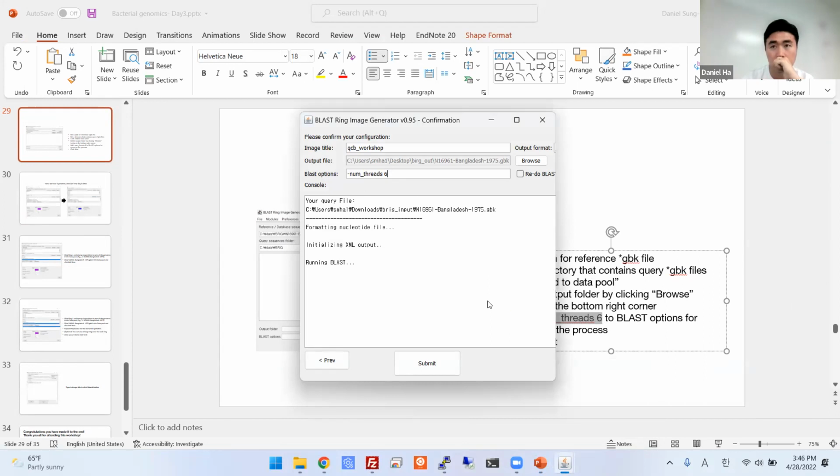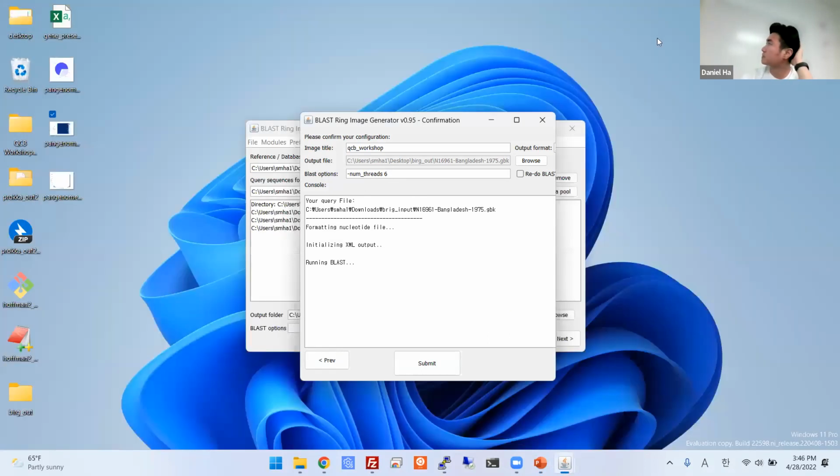Oh, maybe I should have done that. It's still running, right? Yeah, it's still running on mine. I'm assuming it's single threaded. Yeah, that's why it's slow. On my laptop it would be a lot faster because it's only 3 genomes, but apparently it's not.